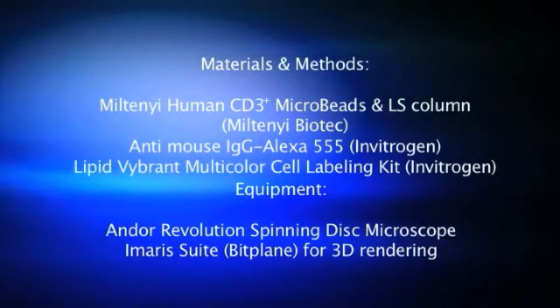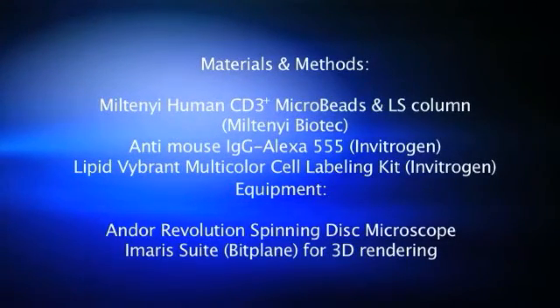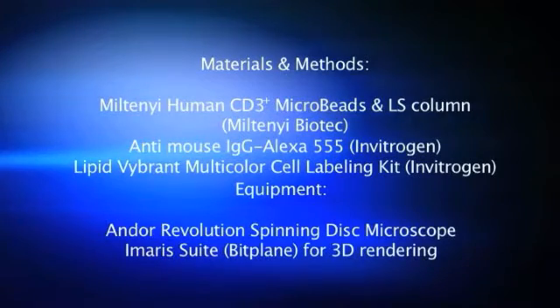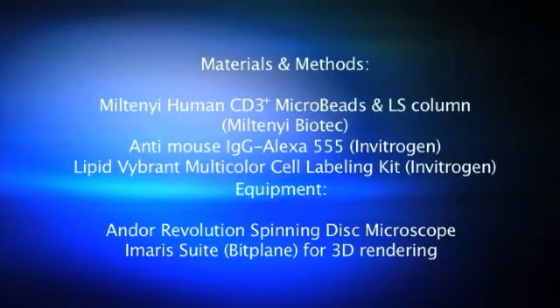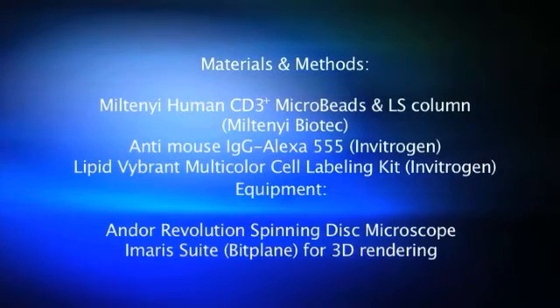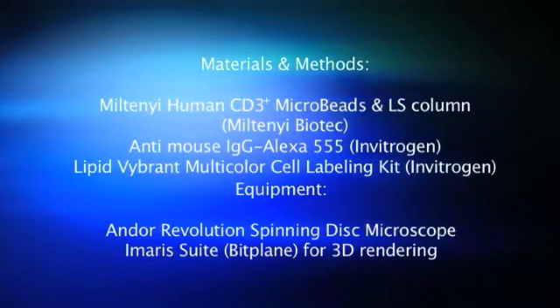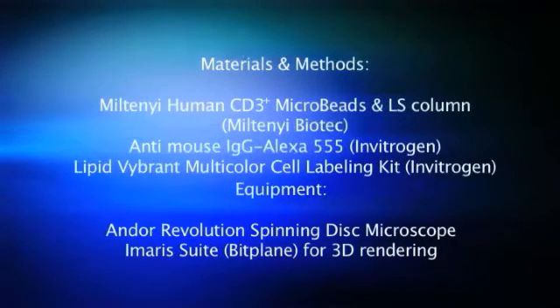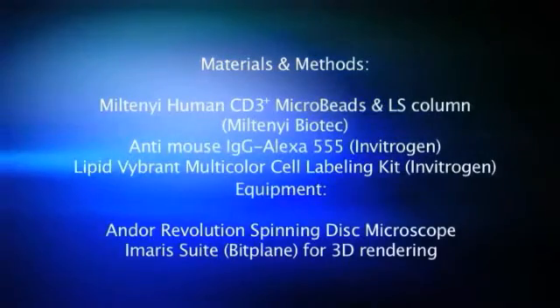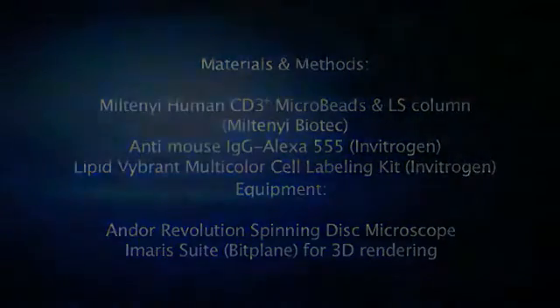Miltenyi human CD3 microbeads were labeled with anti-mouse IgG Alexa 555, while human peripheral blood mononuclear cells were labeled with a lipid-vibrant multicolor cell labeling kit. This kit stains the lipid membrane blue. Cells were seeded onto glass coverslips and Miltenyi microbeads were let to sediment onto the cells. Live imaging of cells was performed using the Andor Revolution spinning disk and rendered using the Imaris software suite.